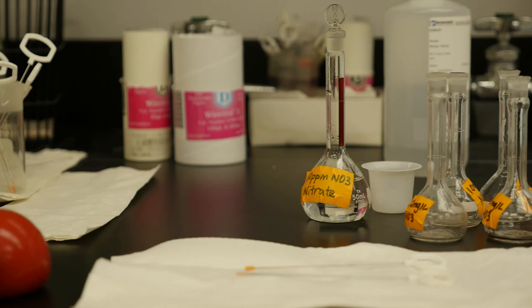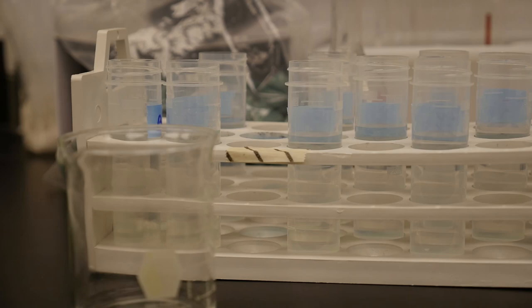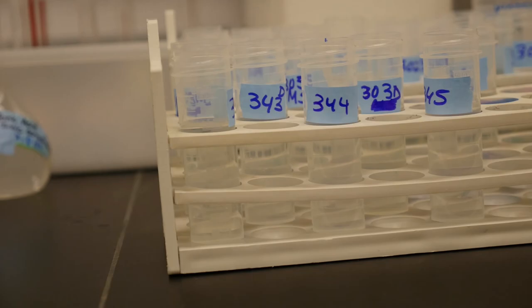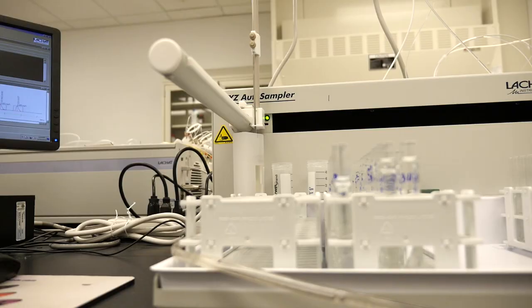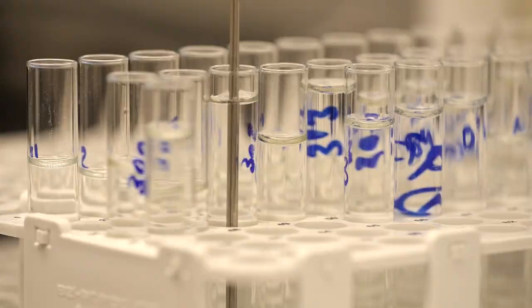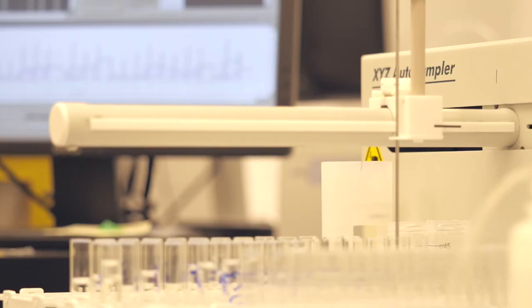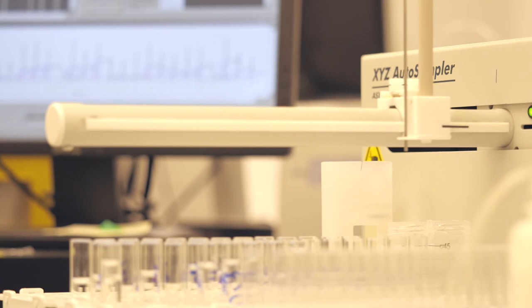Today we'll be analyzing Palmer River samples that we've been receiving all summer long. And we will be analyzing them for nitrate nitrite, so that is a combined form of nitrogen, and digesting the same set of samples for total nitrogen. What we'll do is take that sample, log it out of sample login, bring it to the lab, check that the sample is in the correct condition for the analysis. Then we'll take it through our tests using EPA methods.